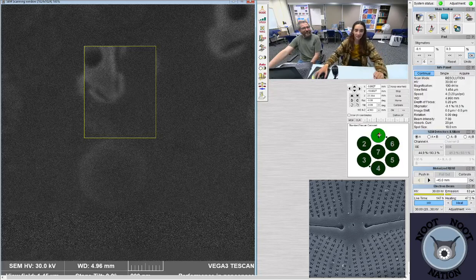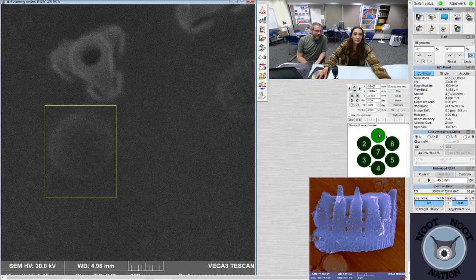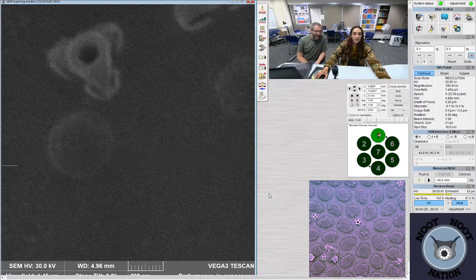Now when you let go? A lot sharper. It is better. And you can actually start to see the little pores on that. You just need to slow the beam down. They'll show up. And maybe just a little out of focus. Yes, I think I need to. But they're there.